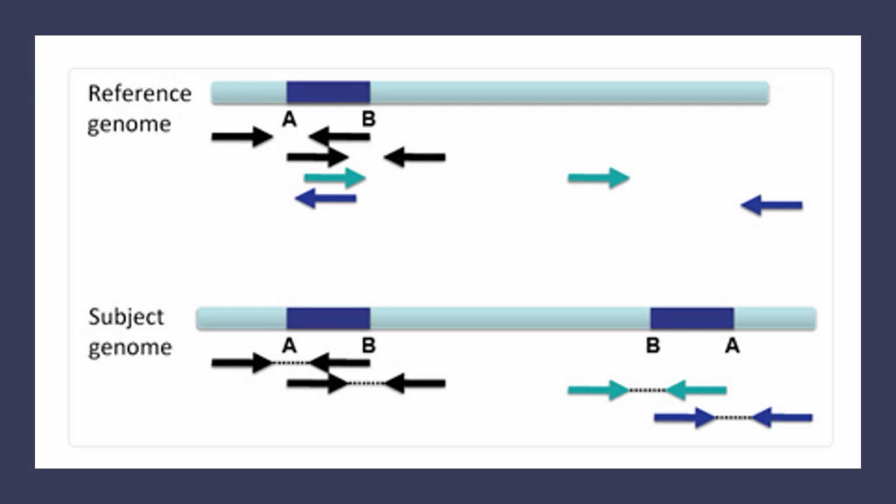The turquoise and purple arrows are similar to those shown in the earlier inversion. The difference is how far one of each pair is found from where it is expected to be. The reads encircled here are far from their mates, indicating that the region they have mapped to has been repeated where their distant mates are. Examination of the unaligned soft-clip bases can provide further support for a structural variant like this.